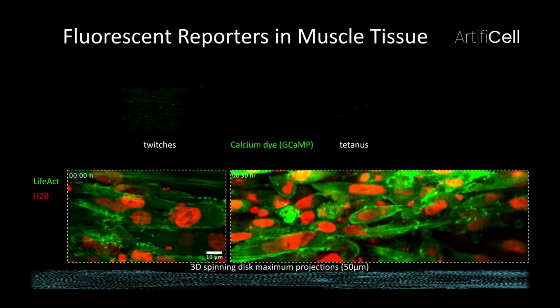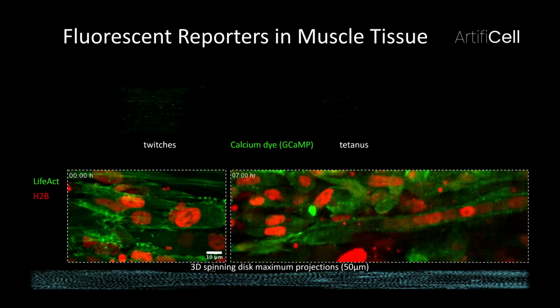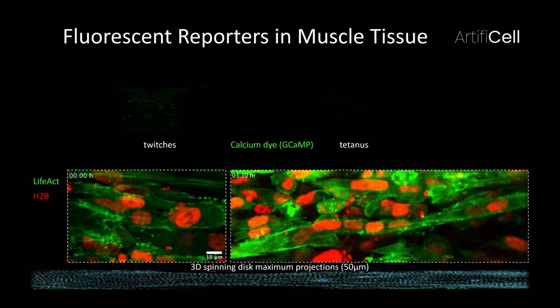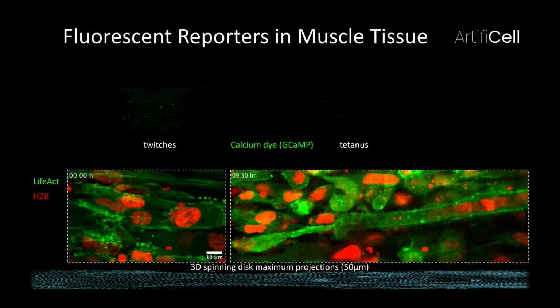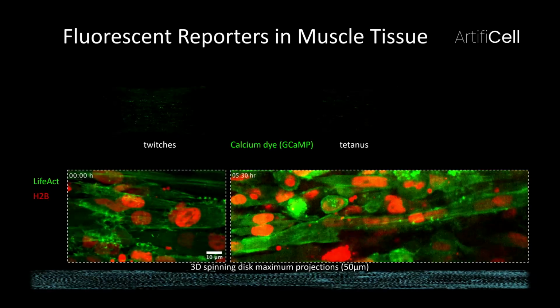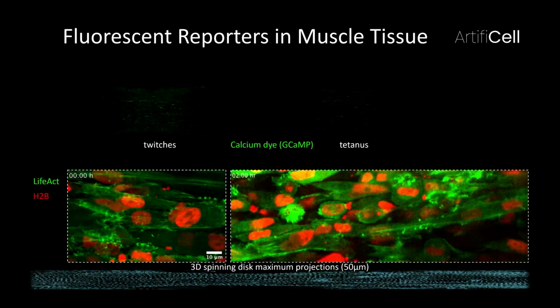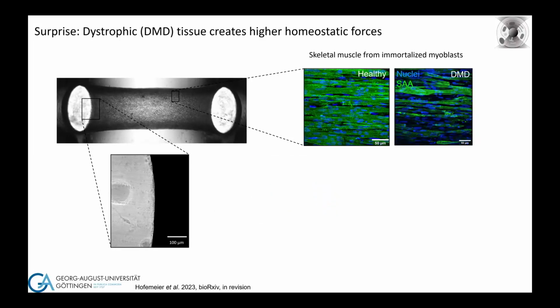But the take-home message that I would like to give you, if you care about having good microscopy of such muscle systems: in other systems, very often you have to unmount them later and put them back into the microscopy situation. And that works, this is not a problem, but it's extremely tedious. And very often you actually start to damage the tissue. So the advantage here is you have it there, you put it on the microscope and you go for it. All right.